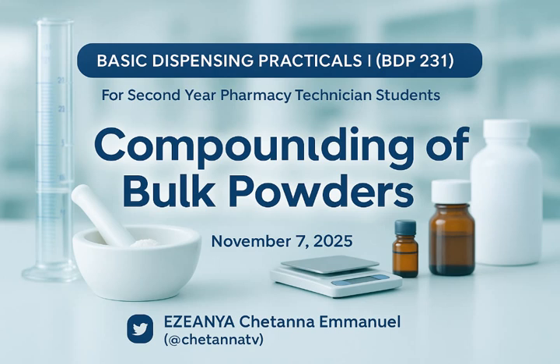If you're not mixing them, what do you have remaining there? You take 40 grams of this and pour and mix properly and you're good to go. This one is straight because of their quantities. Is that clear? This is how to do geometric what? Dilution or doubling up. Are we together? Alright, so follow that step in mixing your powders and you don't have issues.